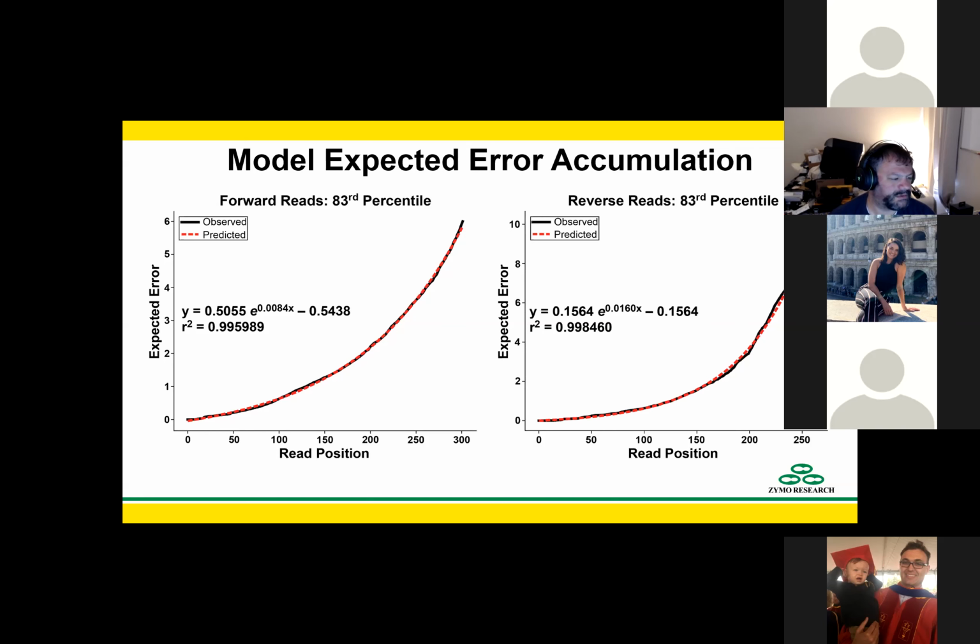Let's see. Yeah. And then I had errors above that say dependency ShortRead is not available for package DADA2. I had quite a few of those actually. Okay, try running the installation again. I think if you get one of those non-zero exit statuses, try starting the installation again. I'm wondering if we're actually causing some of these errors because we have like 16 people trying to install the same packages at the exact same time.